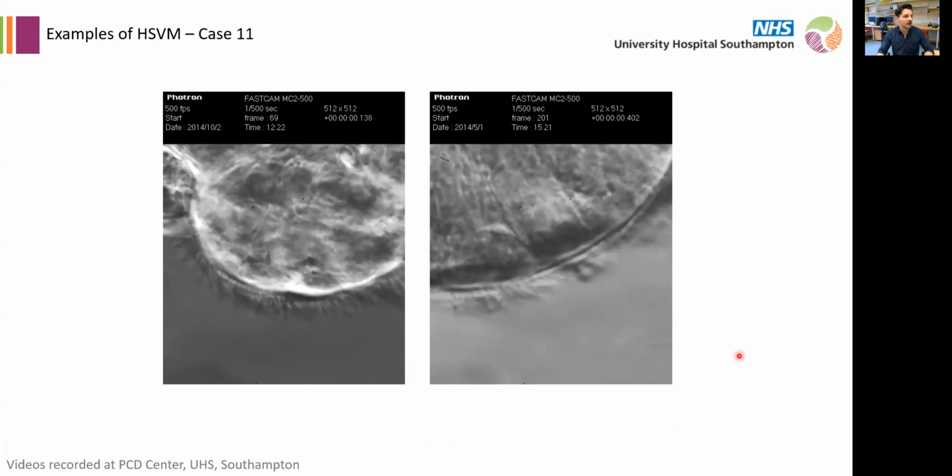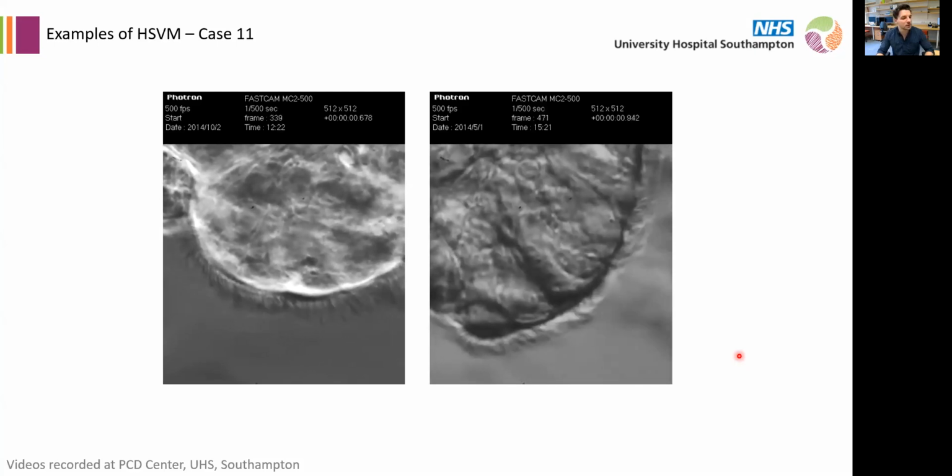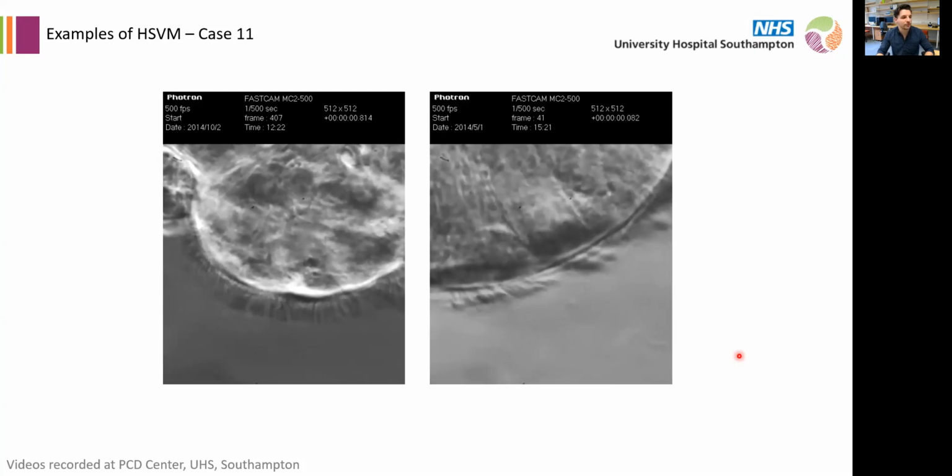So as you can see, high-speed video microscopy can give you an idea of what's wrong with the patient, or sometimes what's actually not wrong. And it also helps, I would say, for non-obvious phenotypes, because if you look at your cilia and they are not moving, it's a pretty obvious phenotype. And so it probably will help you guide the TEM, what you are looking for. Or it may also help you guide the genetic testing. You know, if they are not moving, probably look into dynein arm.